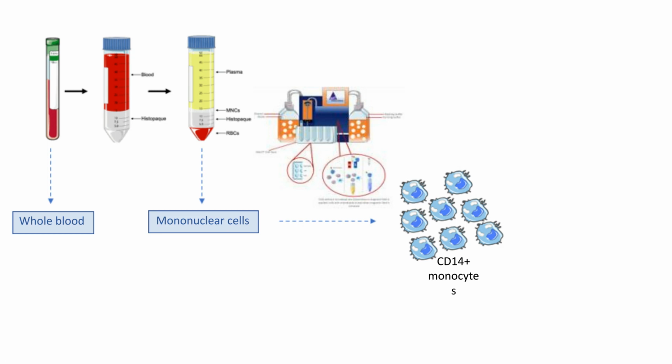So we've already seen a little bit of this from the work Salva presented. So we take our whole blood samples and we do some work with whole blood, and I'm going to give you one particular example of that. We then make mononuclear cells. We're still on density centrifugation, but we are at the moment trialing the untouched PBMC kit from Miltenyi to make sure that we can swap it out with the density gradient centrifugation that has been the historical method of choice. This gives us those mononuclear cells, or those peripheral blood mononuclear cells.